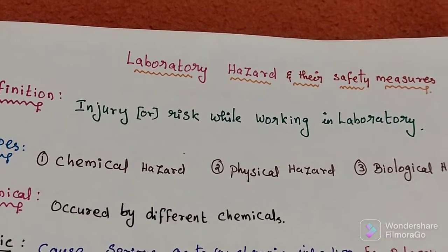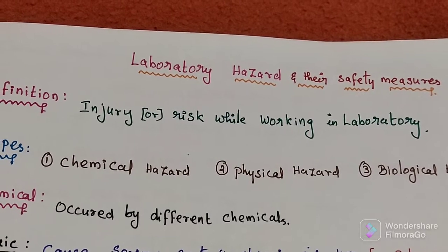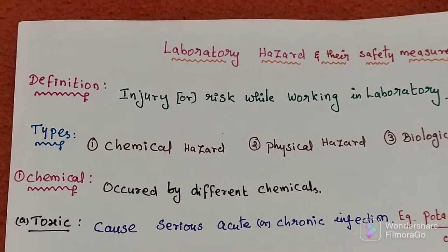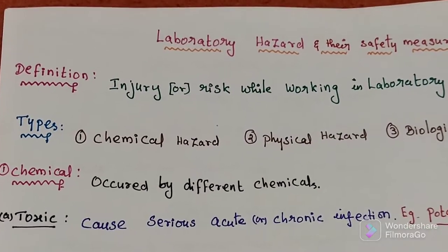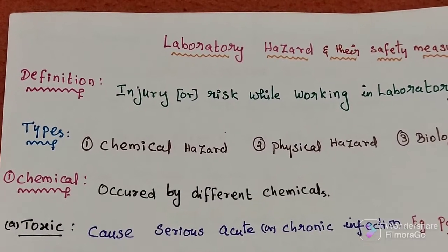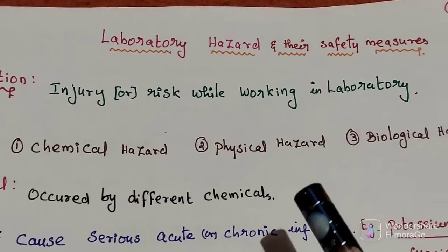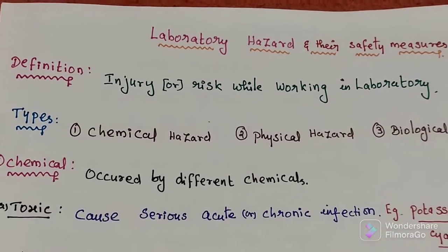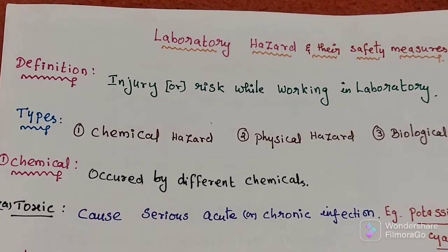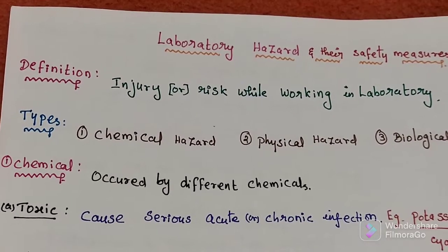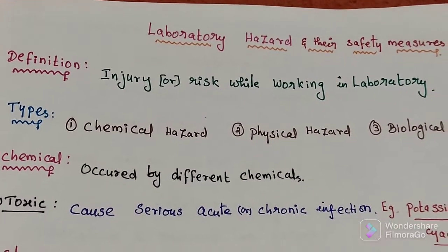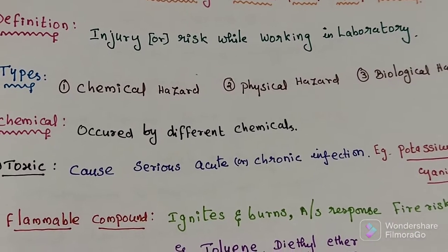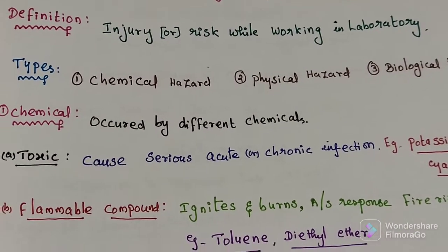It causes injuries or harm to our body. There are three types of hazards: chemical hazard, physical hazard, and biological hazard. Hazards acquired by different chemicals are called chemical hazards. Let's discuss each type one by one.